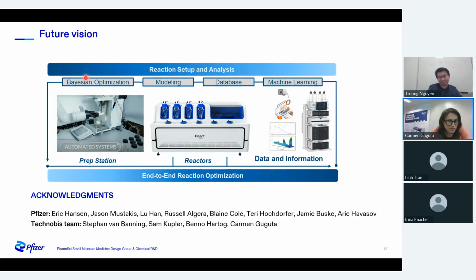Okay, I will try to read a few of the questions that we have received. One of them says, you mentioned reaction kinetics, and the person thinks he may have missed whether the reactor monitors reaction progress itself or submits those samples to HPLC.